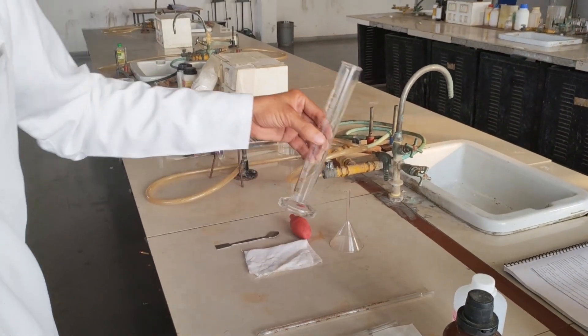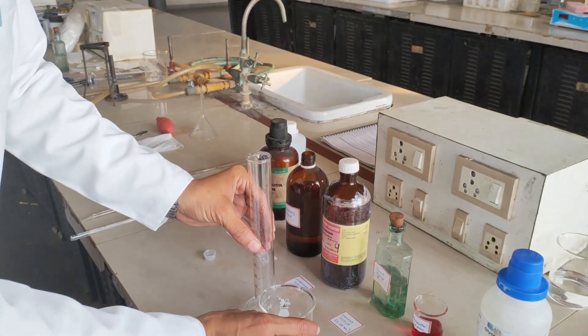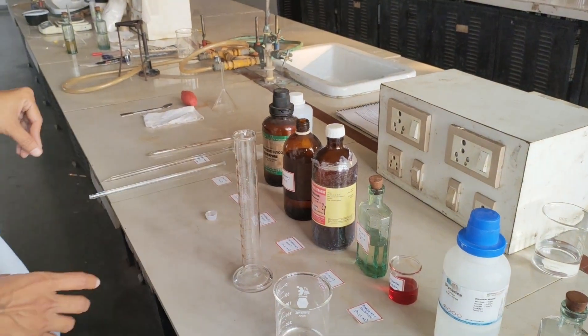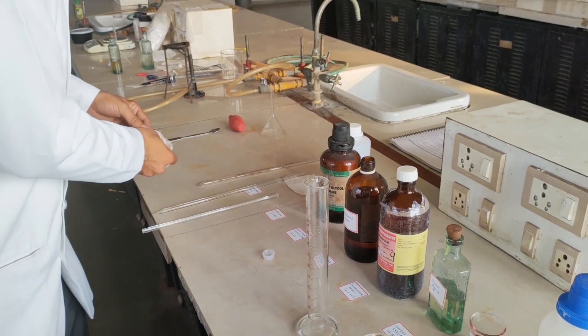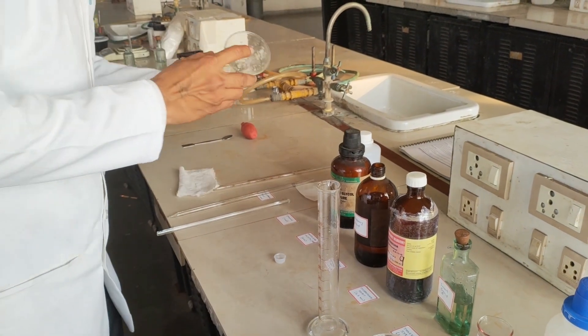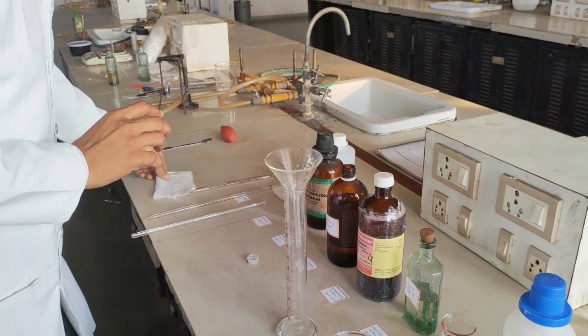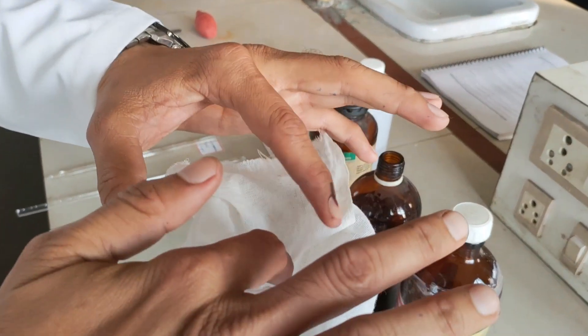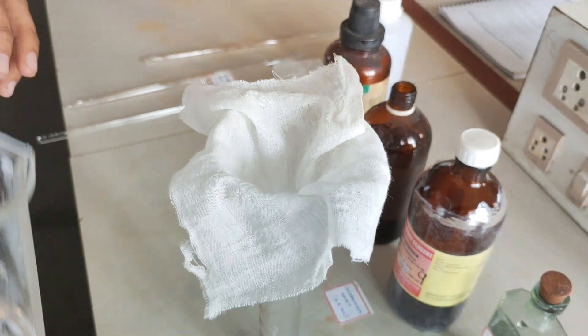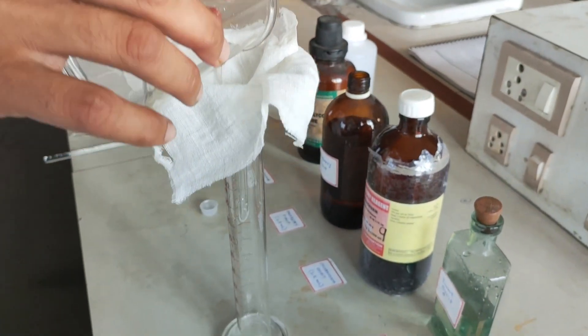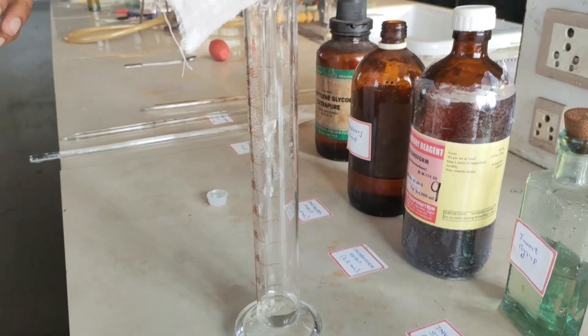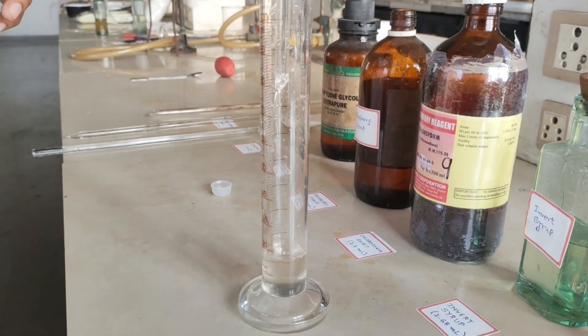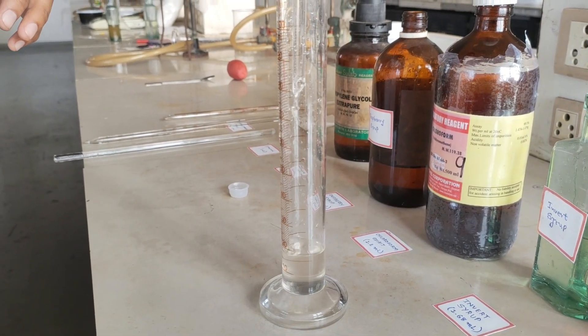Now take one measuring cylinder. We are going to filter it out for insoluble impurities using the muslin cloth.